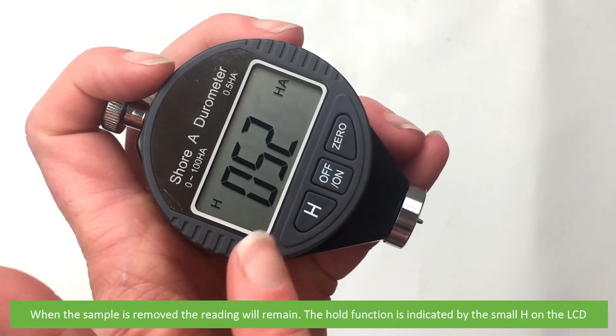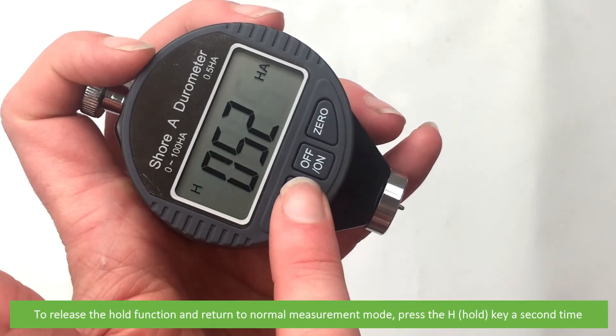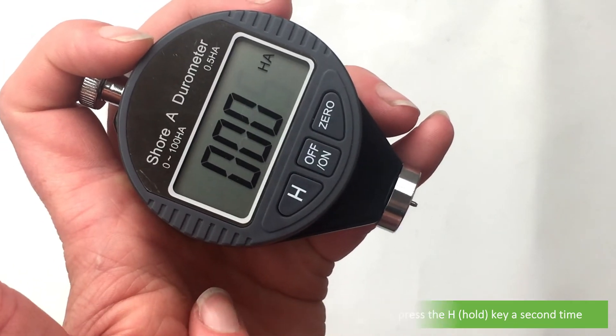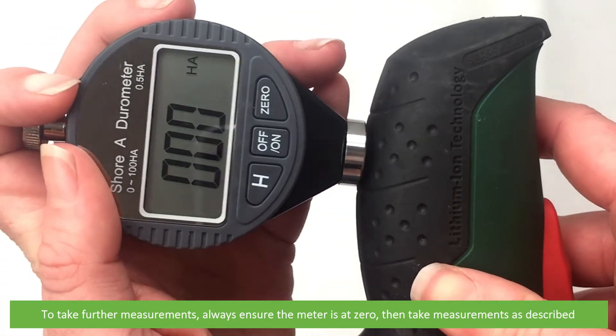The hold function is indicated by the small H on the LCD. To release the hold function and return to normal measurement mode, press the hold key a second time. To take further measurements, always ensure the meter is at zero, then take measurements again as described.